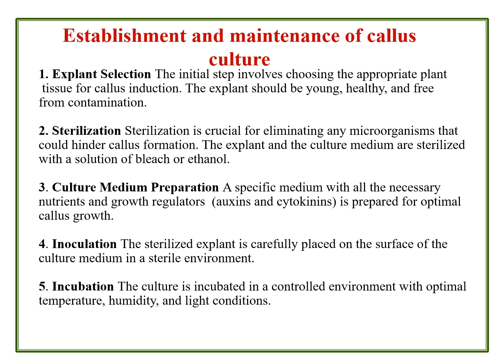So here the meristem plays a significant role in sustaining the callus cells on the MS medium supplemented with a variety of combinations, that is, auxin rich and cytokinin less concentration. The next factor is the sterilization.